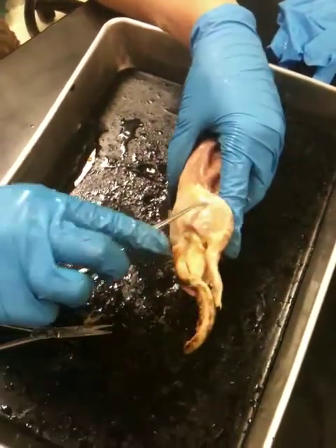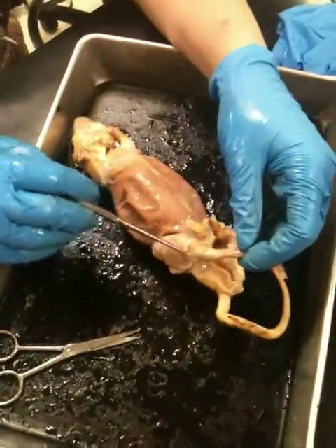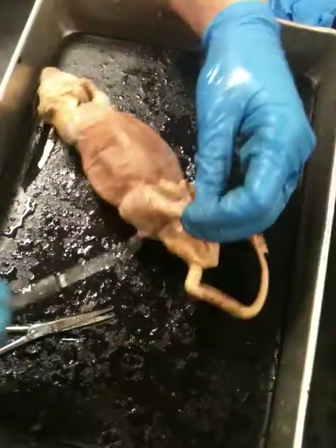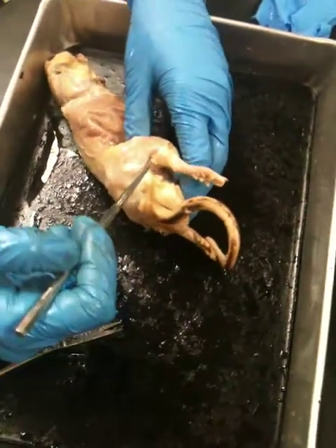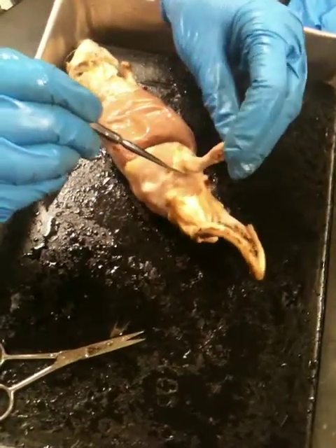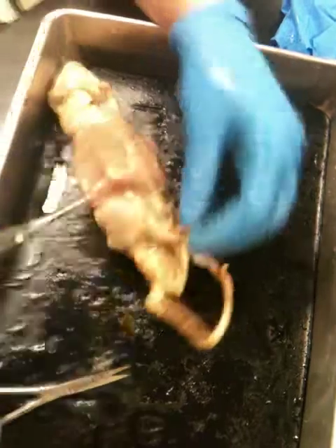So this over here is going to be the femoral. Now off to the side, right over here, this is going to be the fibular. This is the patellar, the kneecap itself. Completely opposite of that, right here, just that point would be the popliteal. All this towards the back would be sural. Sural, soccer player, the really well-developed gastrocnemius muscles. Goofy way to remember it, but that's sural.